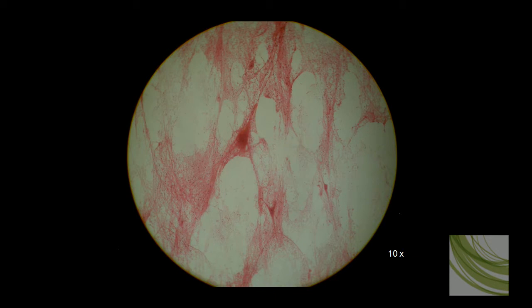Now here we've increased magnification using the 10x objective and we can see a cell body here. We saw it in the previous slide but it was much smaller. Looks like there's some tissue underneath but probably this is an axon hillock where I'm pointing leading to a long axon.